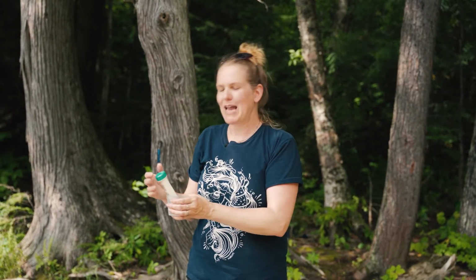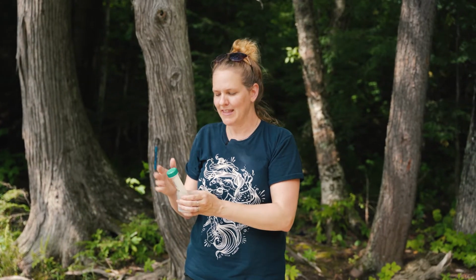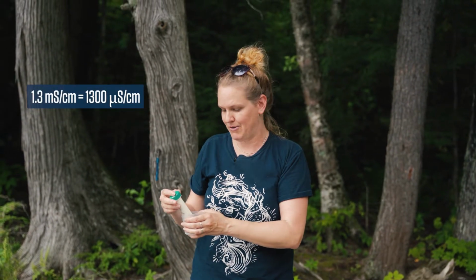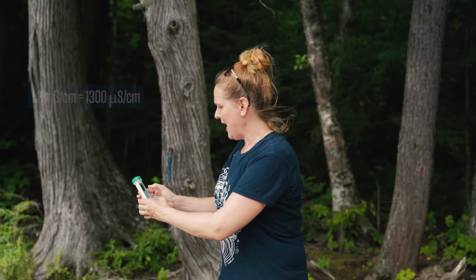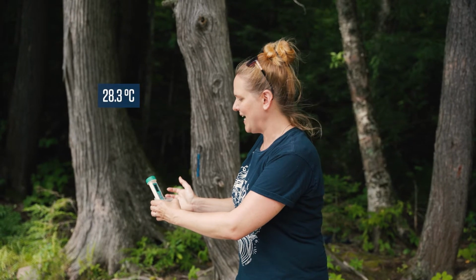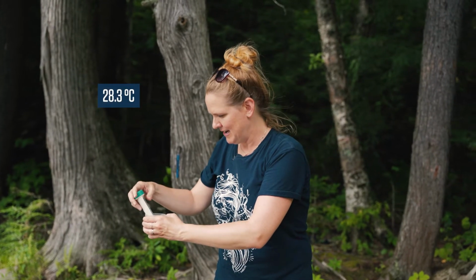Now, this is a very, very low conductivity reading. If you're in an urban stream, you may notice something like 1.3. This is the moment that you're going to look at the corner and see if it says mS. That means it's in millisiemens, and we need to multiply our value by 1,000. So 1.3 would be 1,300. So we have 81 microsiemens per centimeter, and our temperature here is 28.3, pretty hot.